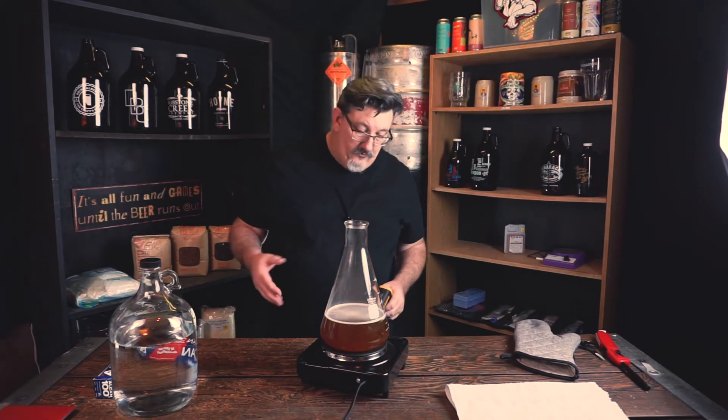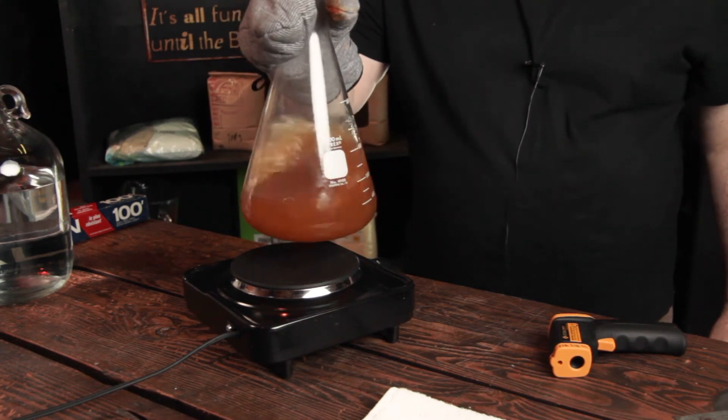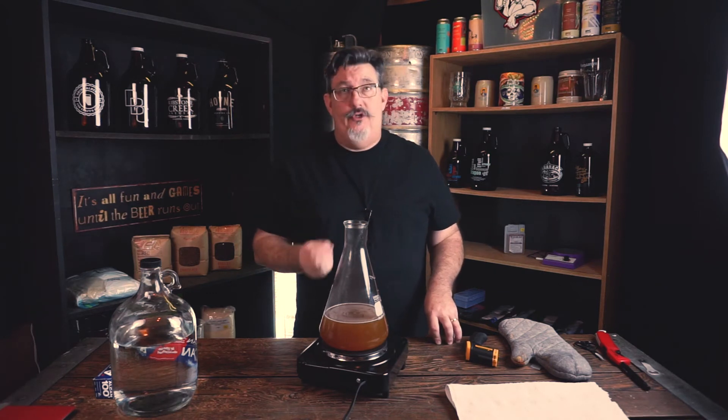There's also action going on from the boil — we're starting to see those proteins coagulating, which is the beginning of our hot break. Let me give it a little swirl to help break those things up. Be careful when you swirl an Erlenmeyer: swirling creates a vortex in the middle, and vortexes are low pressure. Boiling occurs at a lower temperature at lower pressures, so when you set it back on the burner it can instantly shoot wort right out the top.